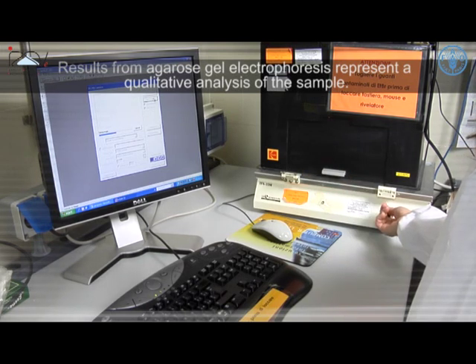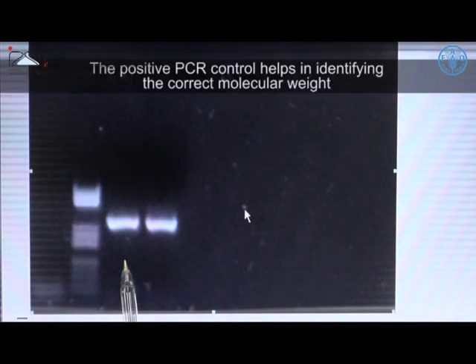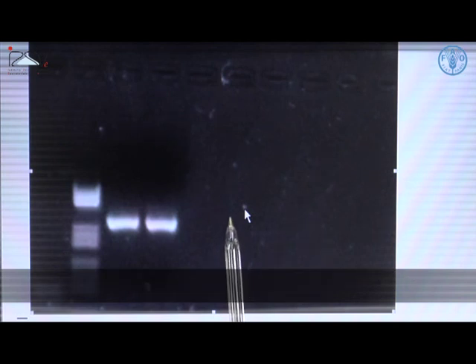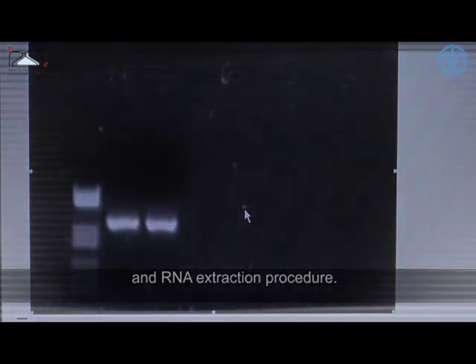Results from agarose gel electrophoresis represent a qualitative analysis of the sample. Positive results are characterized by bands of the expected molecular weight compared to the DNA molecular weight ladder. The positive PCR control helps in identifying the correct molecular weight and verifies the efficiency of the run. No bands should be visible in the lane corresponding to the negative PCR control or the extraction negative control, indicating respectively the absence of contamination during the PCR and the RNA extraction procedure.